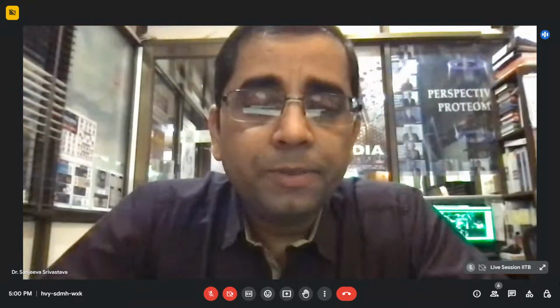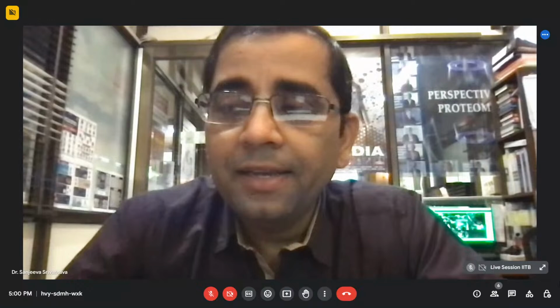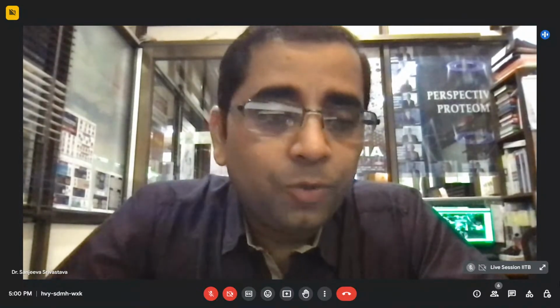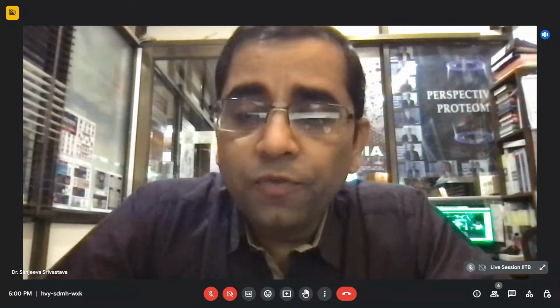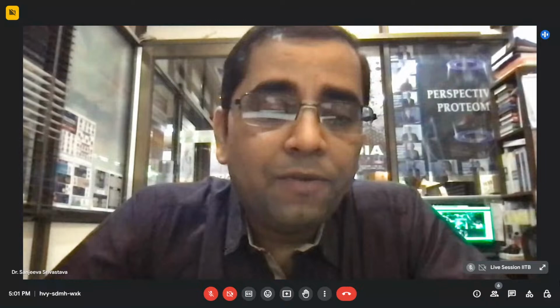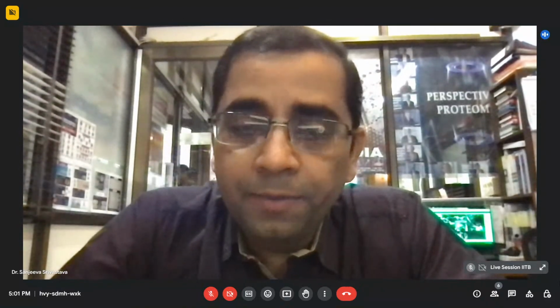All right, thank you, Amrita. So again, this was a bit complicated to really convey in a very short time. But the idea is that let's say you have identified 5 proteins which look very differentially expressed to you, and of those 5 proteins, maybe 3 peptides each. So 15 peptides you want to analyze, and now you are looking at intensities of those 15 peptides across your control and treatment group.